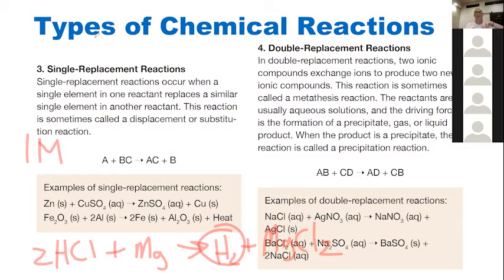We're going to do this reaction under water, which makes it even more fun. And the gas will displace the water out of the tube. So I'll show you how to set that up. Because we're going to want a hole in the bottom of the tube, because if we don't, it's going to pop. So we're going to fill the tube with liquid, with HCl and water, and then turn it upside down so it comes in contact with the magnesium, and the reaction should start.